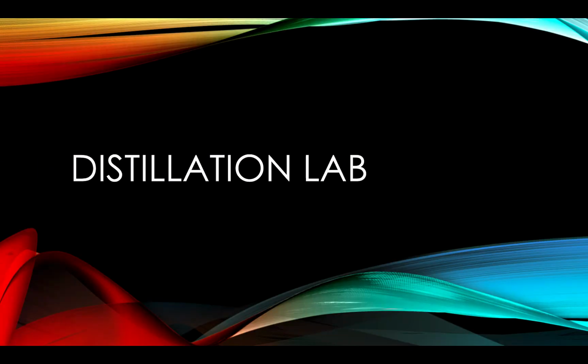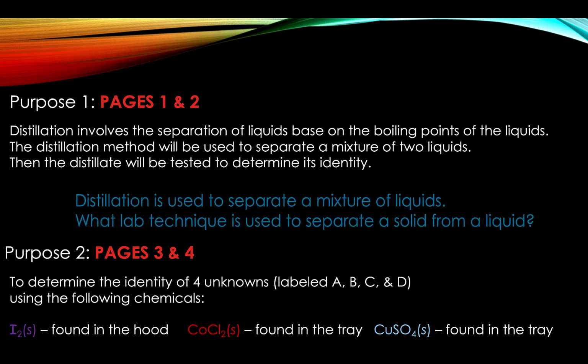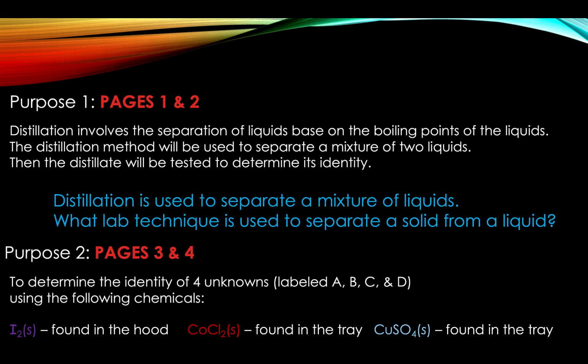During this lab, we are going to perform a distillation. Pages 1 and 2 of the lab involve separating a mixture of two liquids based on their boiling points. A distillation is simply a separation technique that allows you to separate a mixture of liquids.